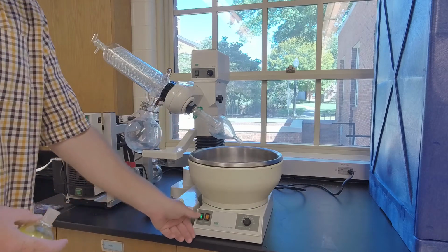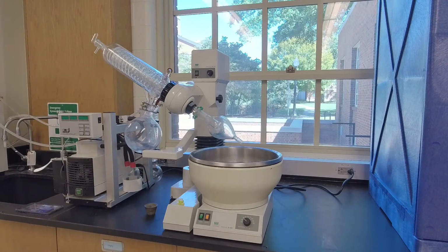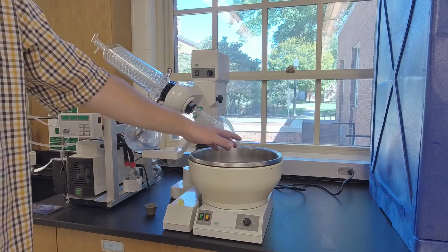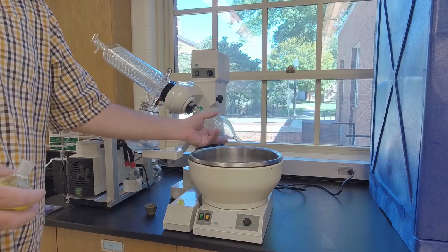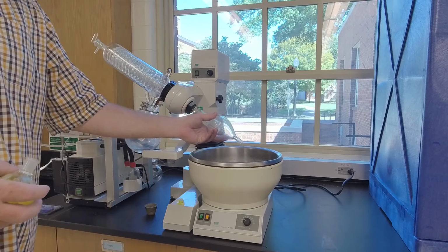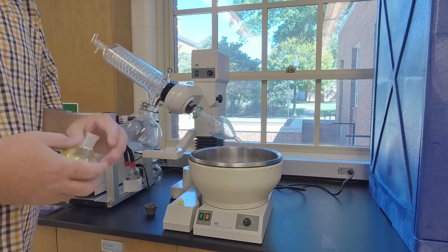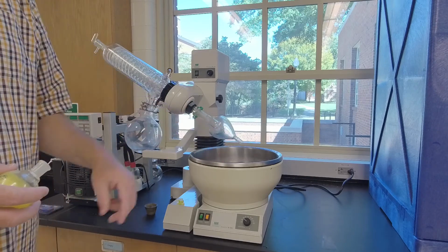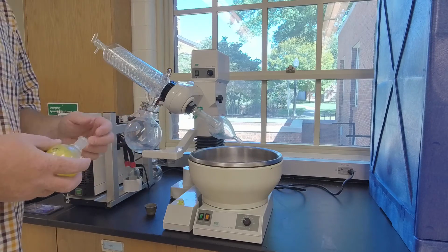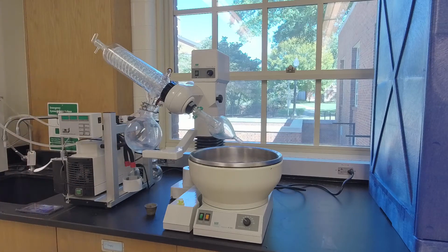All right, turn the bath temperature off. Everything's off here. It didn't bump, so I don't need to clean this. It's a good idea in a research lab, if you're ever there, always clean the bump trap before you rotovap. Somebody else, not everything is yellow. So somebody could have left a colorless impurity here. You don't see it, you put your flask on there, and now your material has that impurity in it. All right, I'm going to turn the chiller off, and I'll run through this one more time.